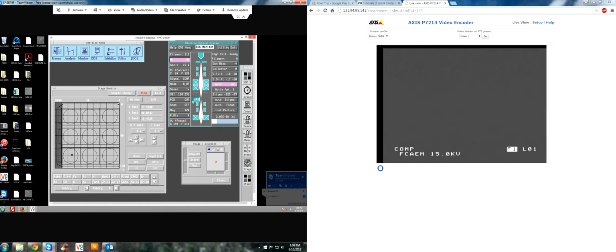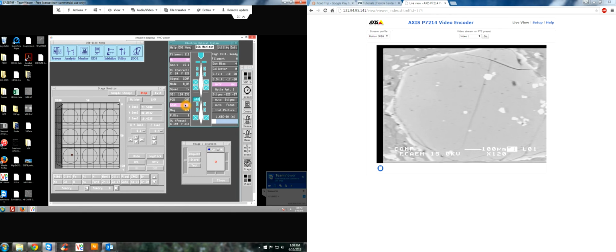Let's open the Faraday cup and take a look at this giant phenocryst again. Okay, good. So this is our sample. Now we're ready to quantitatively analyze this olivine. The first thing you would do is go to the offline menu and hit Analysis, and go to Quantitative Analysis. Now, if you're a new user or a returning user, you want to hit on Sample.